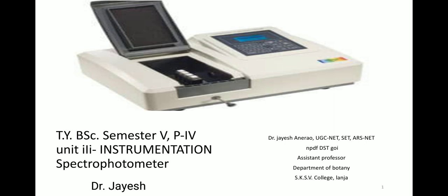In our previous lecture session, we have seen colorimeter, Beer and Lambert's law. Then we have discussed how light decides the characteristics of the test sample. The incident light from the light source can be transmitted, absorbed, or reflected to the sample. The changes that occur during the interaction of incident light with the sample reveal the sample characteristics. Incident light can be adjusted to the wavelength of interest with the help of dispersive or non-dispersive elements. This is what we have seen in the last lectures.